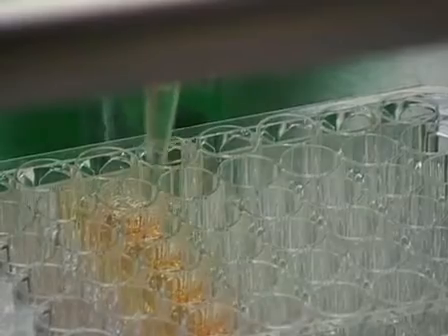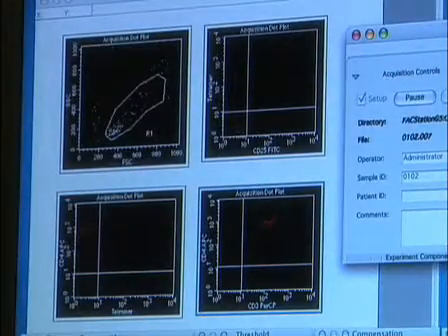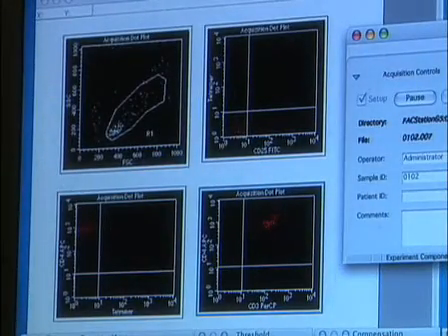And then the second part that I think is probably the most difficult for an inexperienced operator is the data analysis, kind of figuring out which part of the signal really is a positive response versus which part is just inherent to physics and attraction, and the fact that everything has some degree of stickiness to it. That, again, takes a lot of experience, especially in contexts where the overall response is going to be a little bit weak.